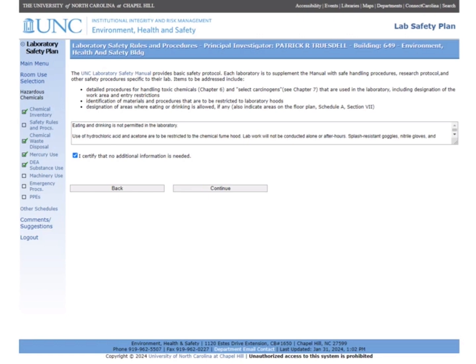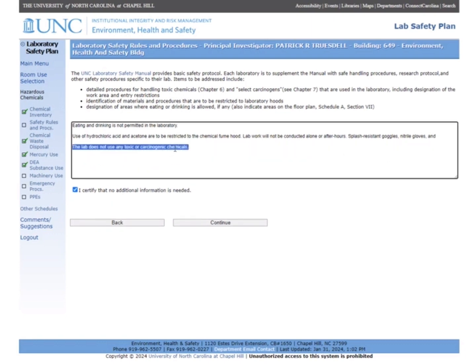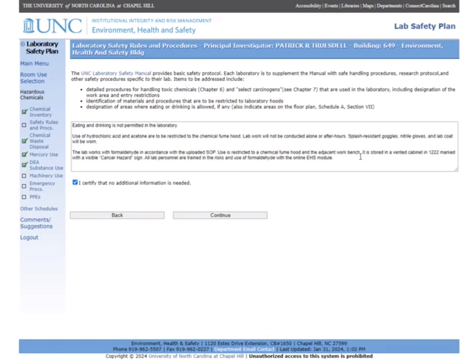In the previous video, we uploaded an SOP for formaldehyde, a carcinogenic chemical. Let's add some more information to the lab safety plan about formaldehyde. When finished with this section, click Continue.